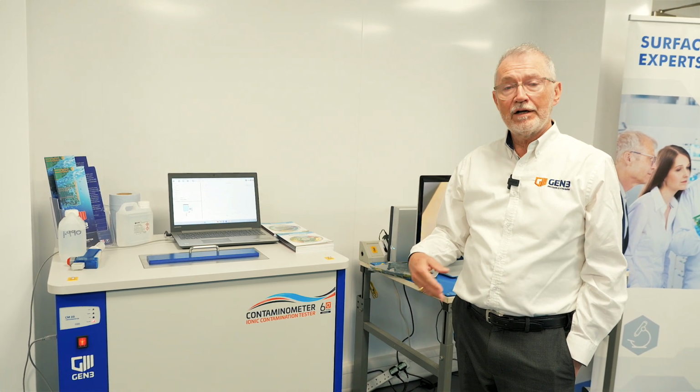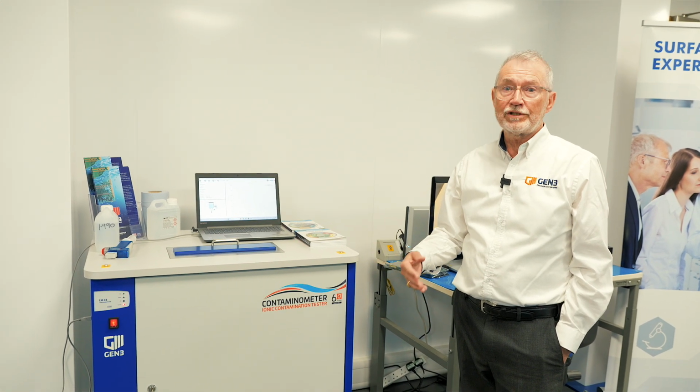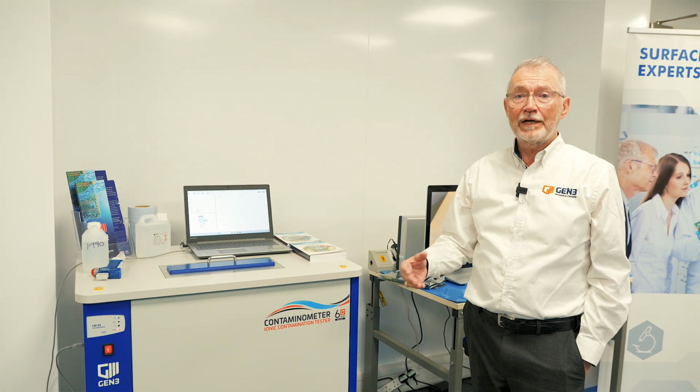You can do that for a whole wide range of boards and components, and the result that you get, you compare that to a library value. So you can use it as a statistical process control. You could use it in the environment of Industry 4, where you're just looking periodically at the process residue budget that's on your circuit boards, and you can relate that back to the library value, and hence whether the product today is fit for purpose.